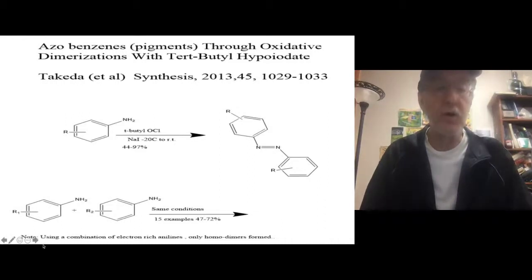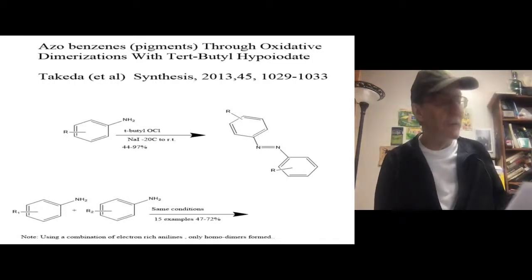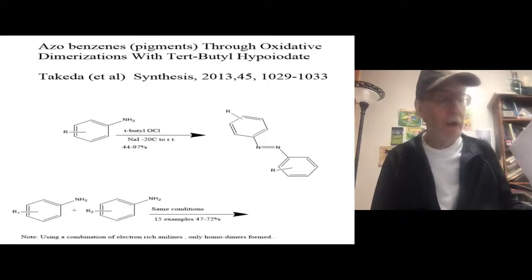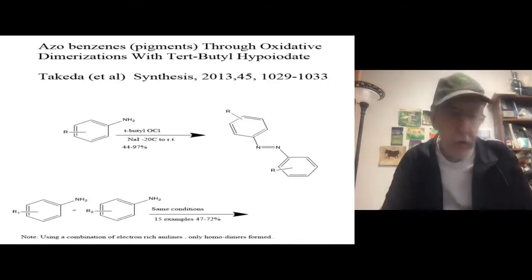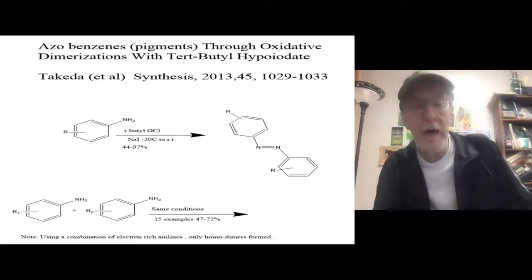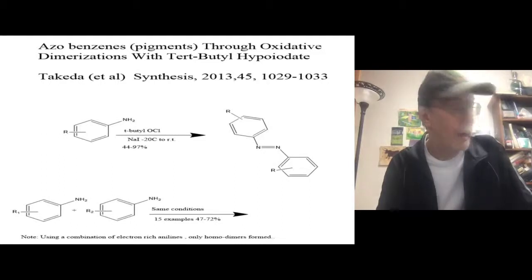Now, another method I want to show you is a recent paper by Takeda et al. in Synthesis, the German journal Synthesis, known to organic chemists. This is Takeda, Okamura, and Minakata, and they are at Osaka University in Japan. This is a very, very interesting paper. You can do this one of two ways: self-coupling of an aniline in the presence of t-butyl hypochlorite. Organic Syntheses has a procedure, very easily prepared. I buy the commercial t-butyl hypochlorite, and then it's converted to the hypoiodite with sodium iodide.